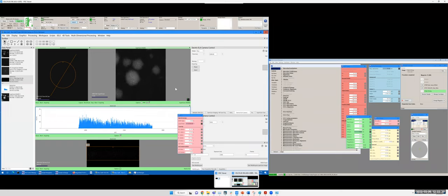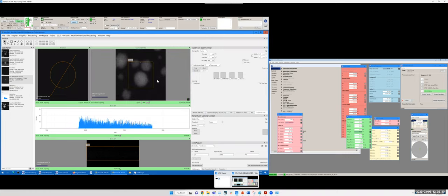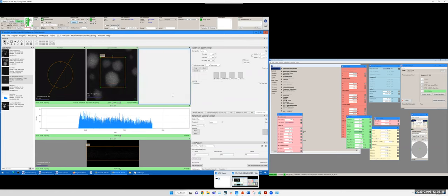And I just want to, because the signal to noise ratio is not very good, I want to acquire 10 frames for 20 seconds. Also, I want to make sure I'm scanning over the useful region. So I will do a sub scan. So I only scan over this region, okay?